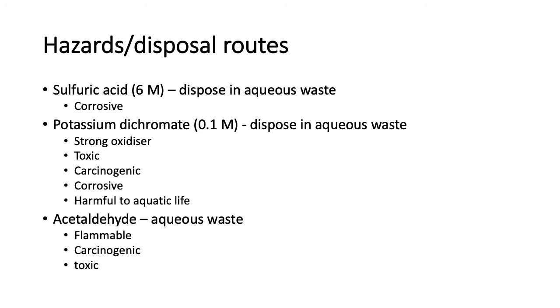Acetaldehyde, disposed in the aqueous waste, add some water. Acetaldehyde is what's made after the ethanol reacts. It's flammable, carcinogenic, and toxic, so gloves. And then the chromium oxide, it's in the aqueous waste.